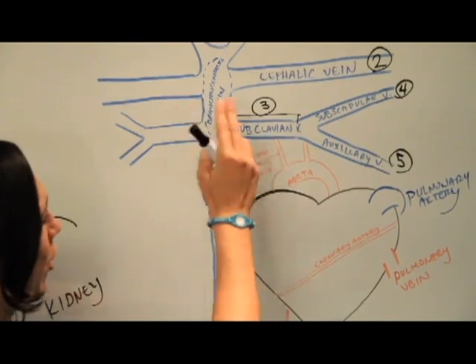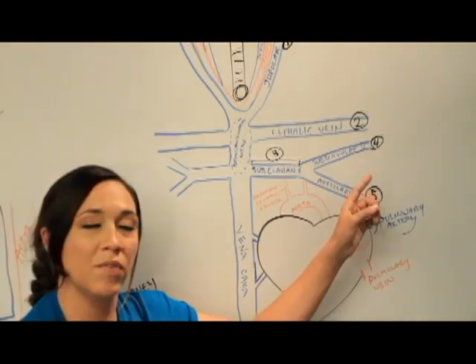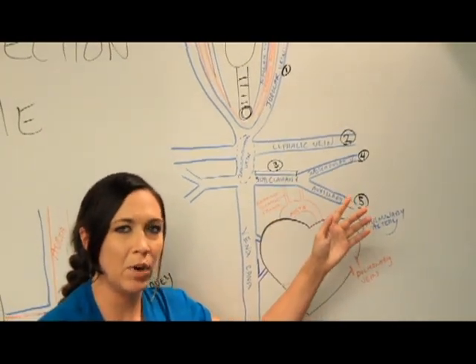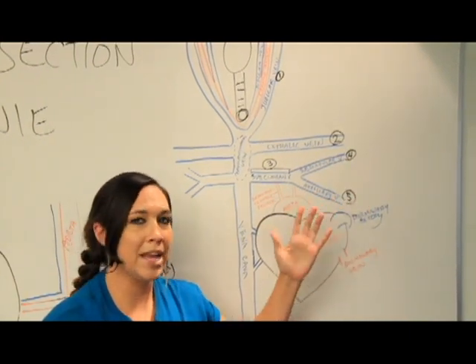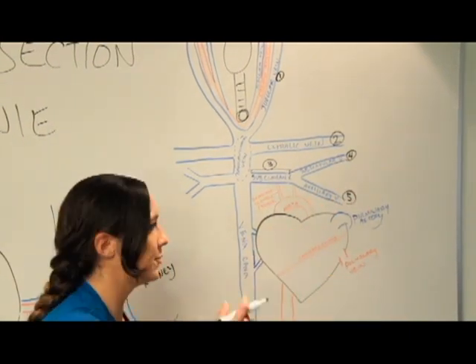And it's going to be the same on both sides. So even if you cut some of these away or you don't get a chance to see them very well, that's okay, because if you can count to 5 and you memorize them in this order, we're going to make it that clear on the day of the test.